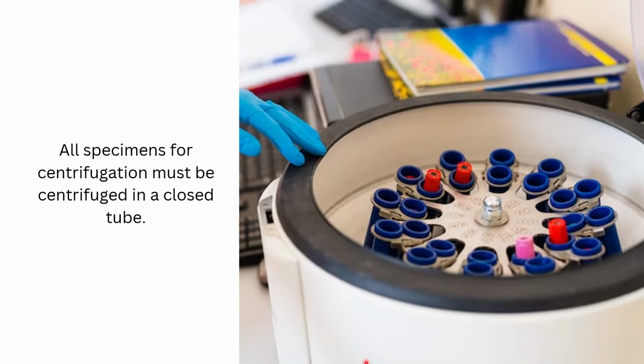All the specimens for centrifugation must be centrifuged in a closed tube. So, you do not centrifuge tubes that are open top. So you also make sure that when centrifuging, class, it is well balanced. That's to prevent the centrifuge from agitating and from falling from the table.